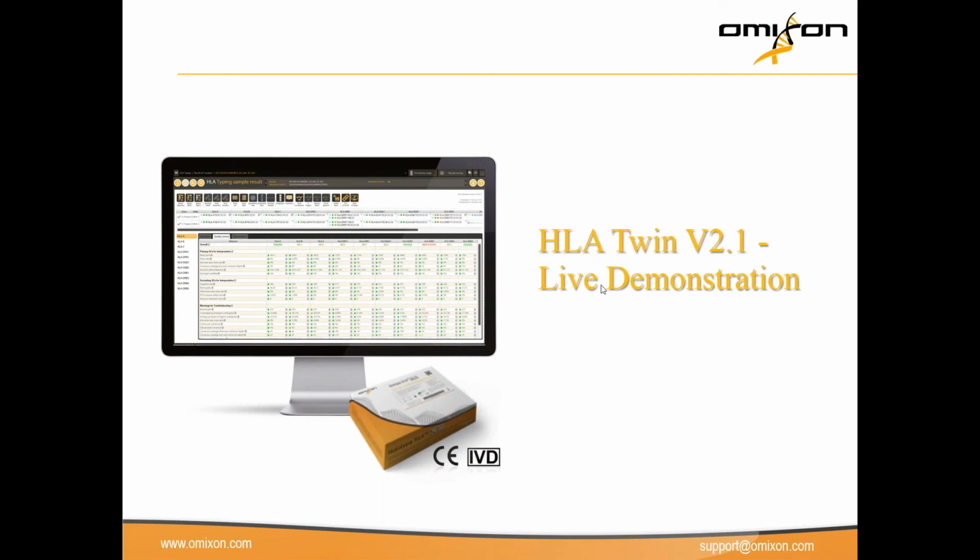But I think as long as you can find the money, it would really improve what you're doing in the lab. So on a similar matter, there is a question here. It says, I only run 8 samples per run, twice a week. Should I still consider automation? Well, that's few samples. But of course, when we're setting up, we will also be able to do it for 8 samples. It's not just set for 24 samples, but of course, with such low numbers, it would probably be better to do it by hand.